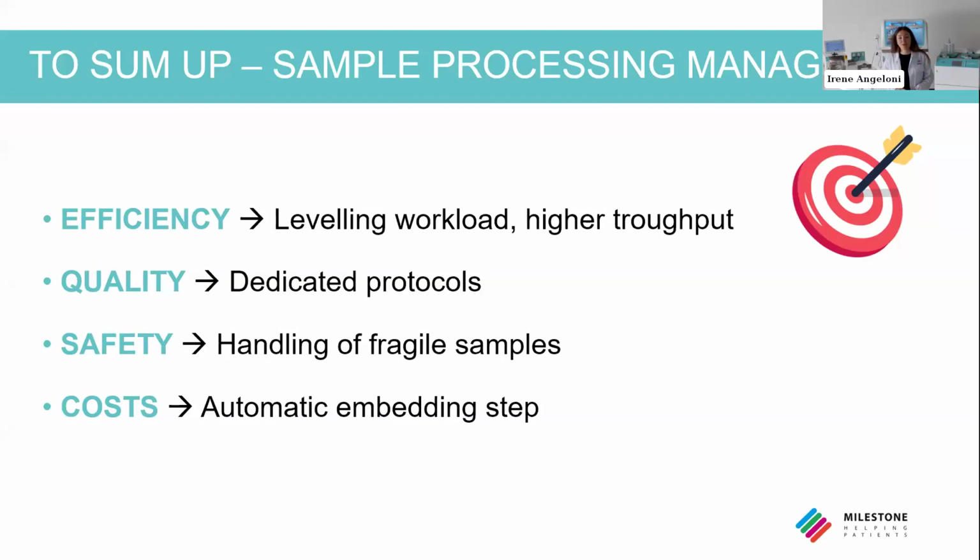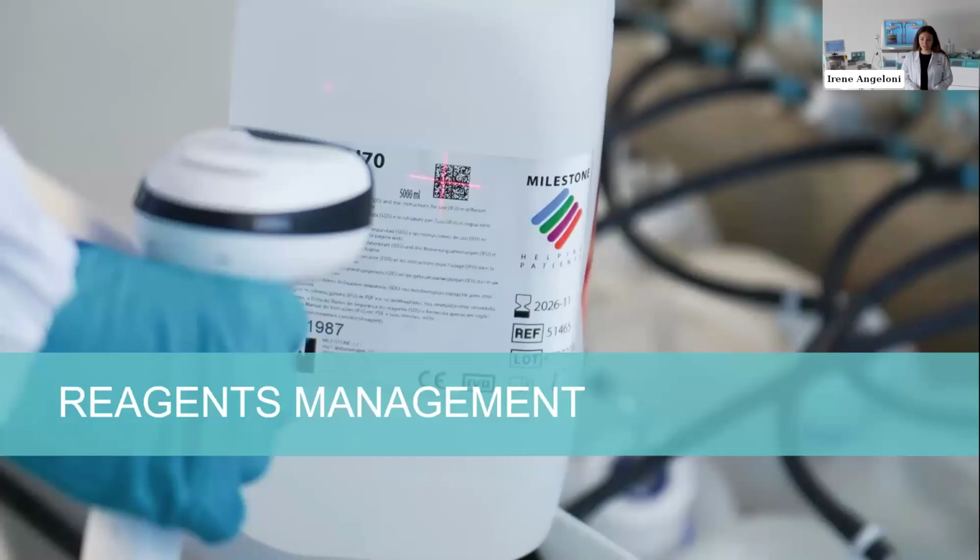Now, let's go into the second topic, that is reagent management. I think it's very important to talk about reagents when talking about the laboratory workflow, also because reagents are essential for almost every analysis in the lab.